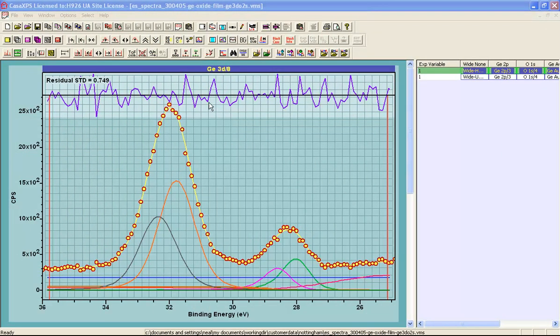In this video we're going to illustrate how to export data including a peak model through the clipboard as ASCII columns which can then be plotted in Excel for example.